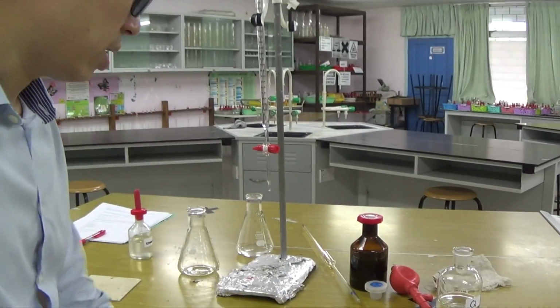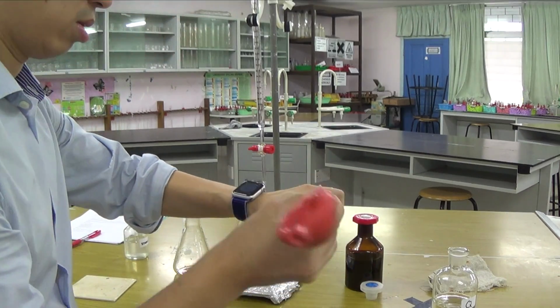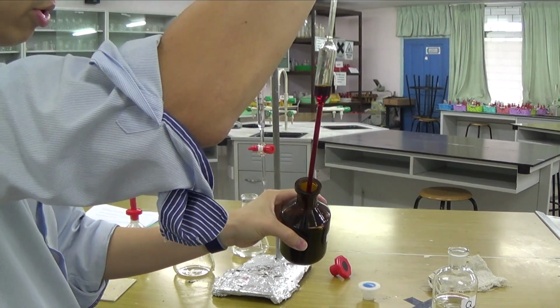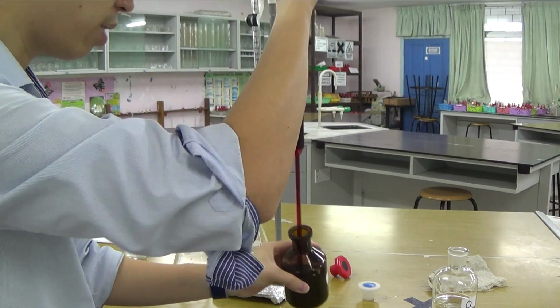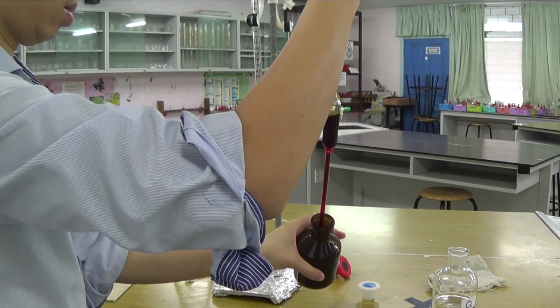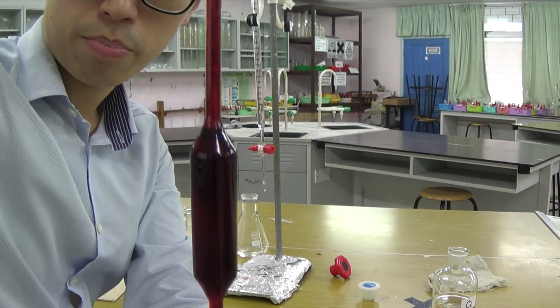So what happened now is, let's just pipette out what we need. Oops. So doing our second exact titre, which is essential. I think I've got a bit of air inside actually. So you don't want air bubbles inside your pipette reading.